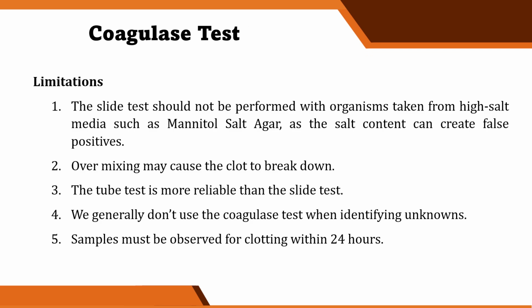So, what are the limitations naman ng ating coagulase test? Okay? So, the slide test should not be performed with organisms taken from high salt media, such as mannitol salt agar, as the salt content can create false positive result. Okay? So, kung yung kanina, catalase, kailangan natin iwasan yung blood sa blood agar, this one naman for the slide coagulase test, huwag tayong kukuha sa mannitol salt agar. Okay? So, pwede tayong kumuha sa nutrient agar, sa BAP.